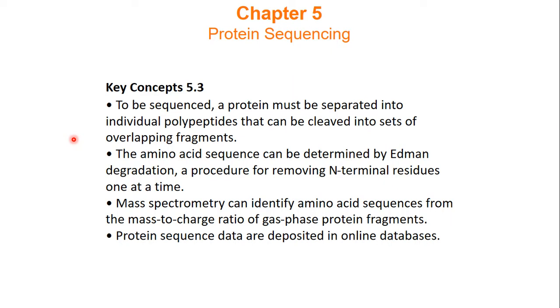In this video, we're going to look at how we sequence proteins. And the idea behind sequencing proteins is a lot like how you sequence DNA. For proteins, though, you can have multiple chains. So the first idea is that you need to separate your multiple chains.